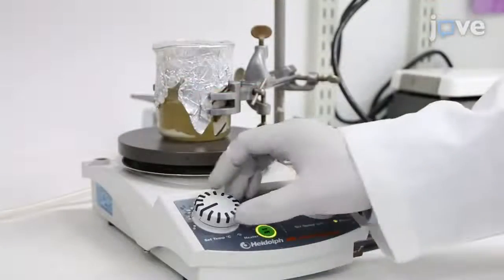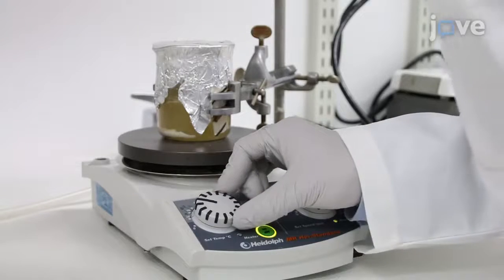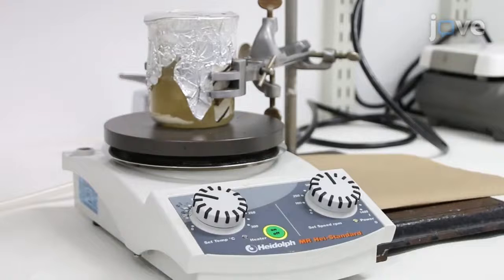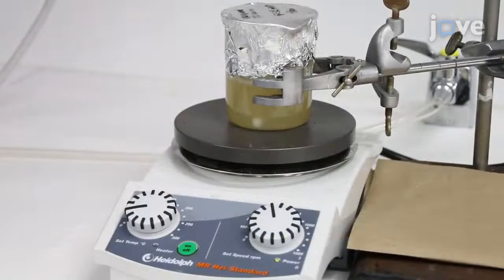Then continue the agitation at room temperature for 2 hours.